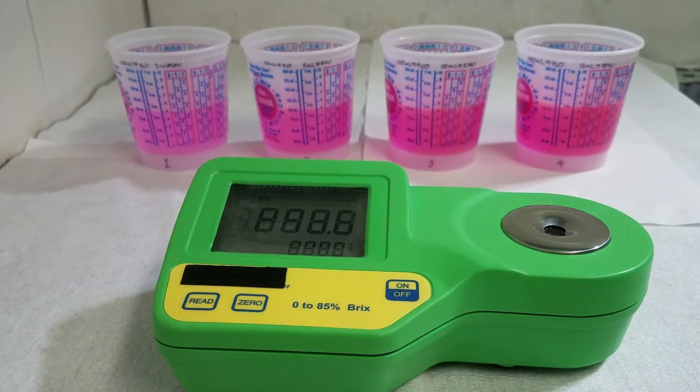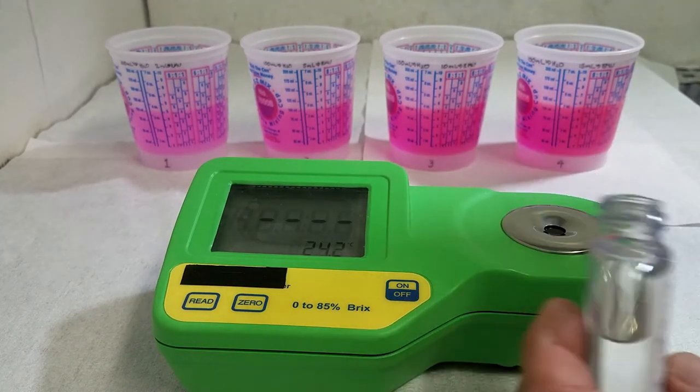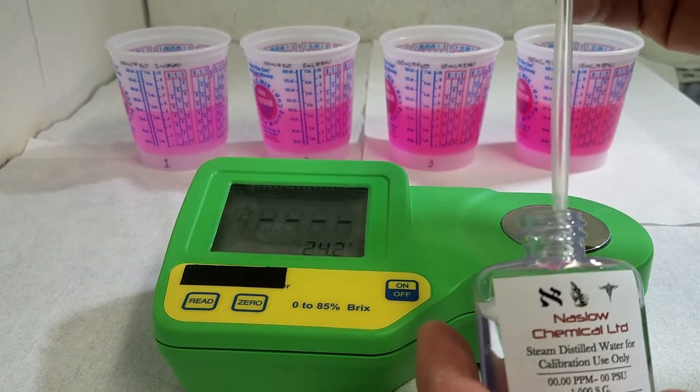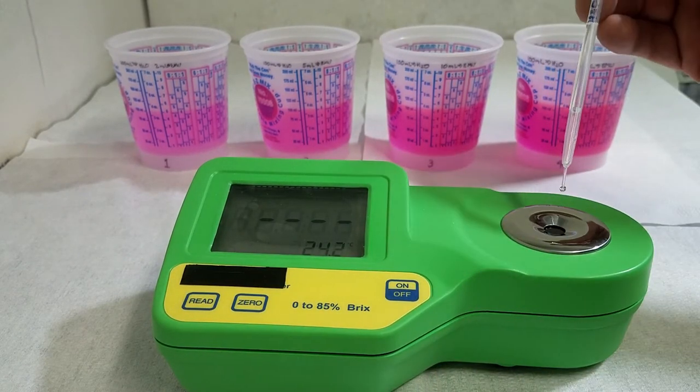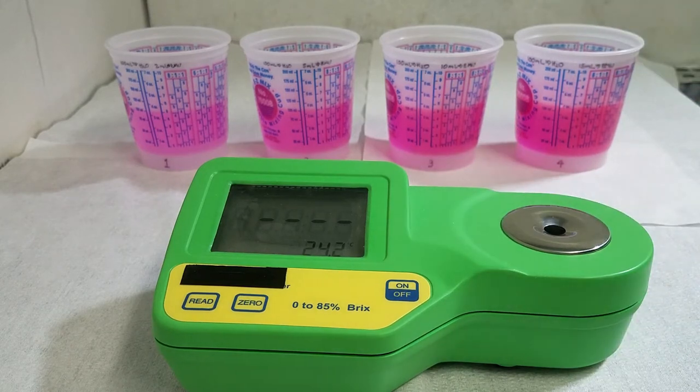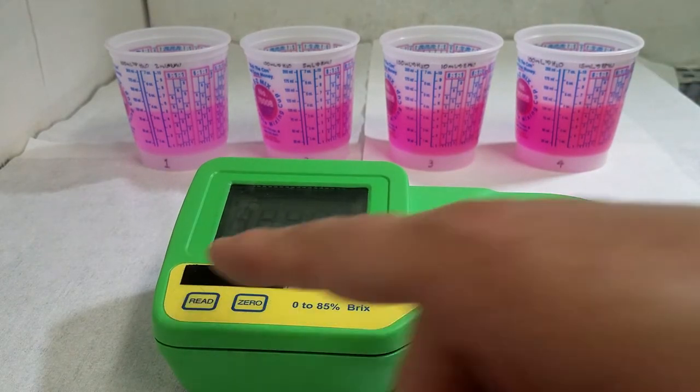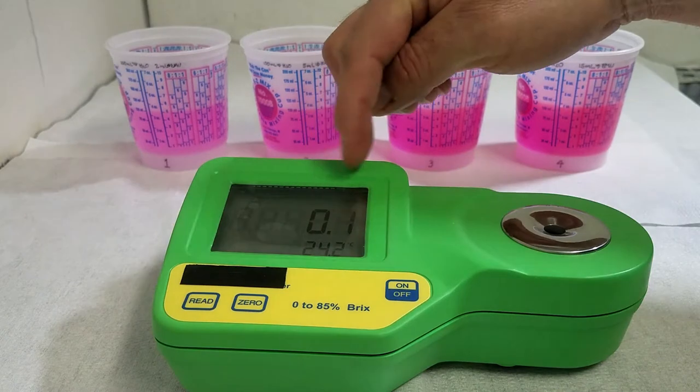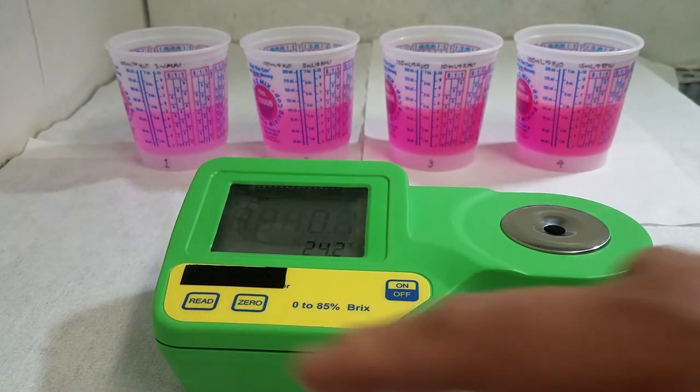To start using the refractometer, we need to set the reference point. Using a clean pipette, we are going to apply some drops of distilled water into the window sample. After, push the read button to get the measurement.